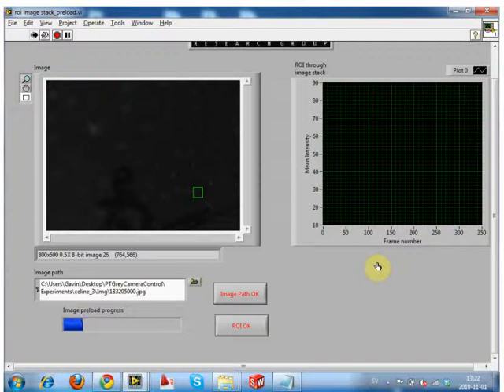But it's going to number them wrong, and all of your attempts on the other ones have been wrong. So the data would have looked noisier than it was supposed to, because it was analyzing the files in the wrong order. They were more or less in the right order, but there were all these breaks where it would stick in extra numbers. The result on the data would be something that was increasing, and then there'd be a pop down, and then some more, and then another pop down, and then a couple of pops down, because of numbers that it's picking in.